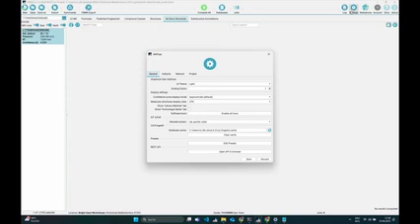If you click on this gear, you have a settings panel, and you can select some options. So for example, you can toggle the default confidence score mode. What I haven't shown you before, but this is also new, is that there are now some tours. If you start SIRIUS for the first time, probably this happened to you. You got some dialogue which said, do you want this tour to guide you through this particular panel? And maybe you just clicked skip, but you can actually also enable them if you disabled them before. But what I really wanted to show you is there are now two settings: show homolog series tab, which I will now enable.